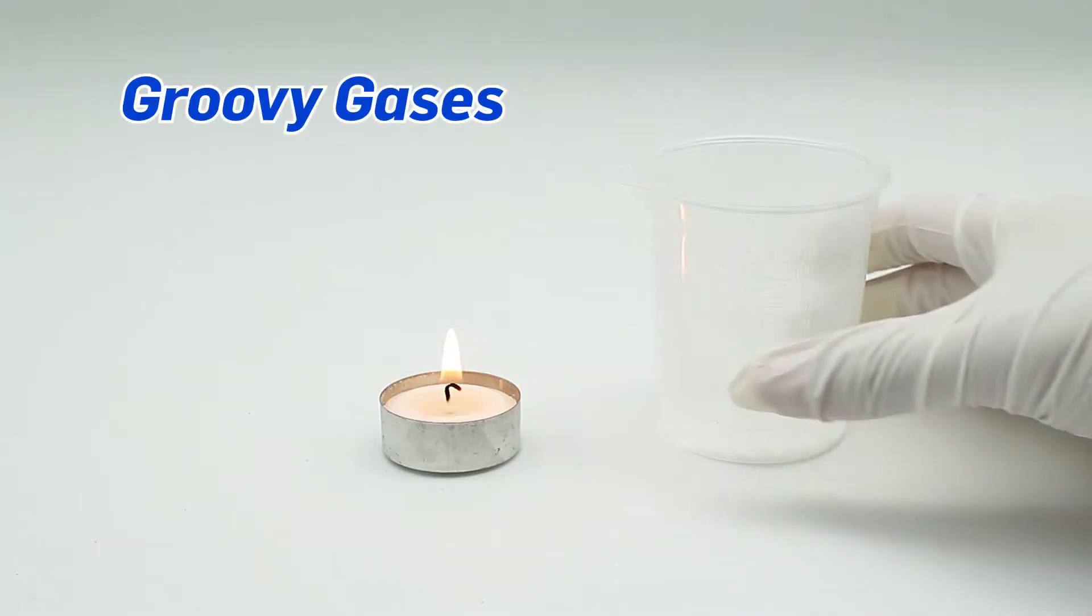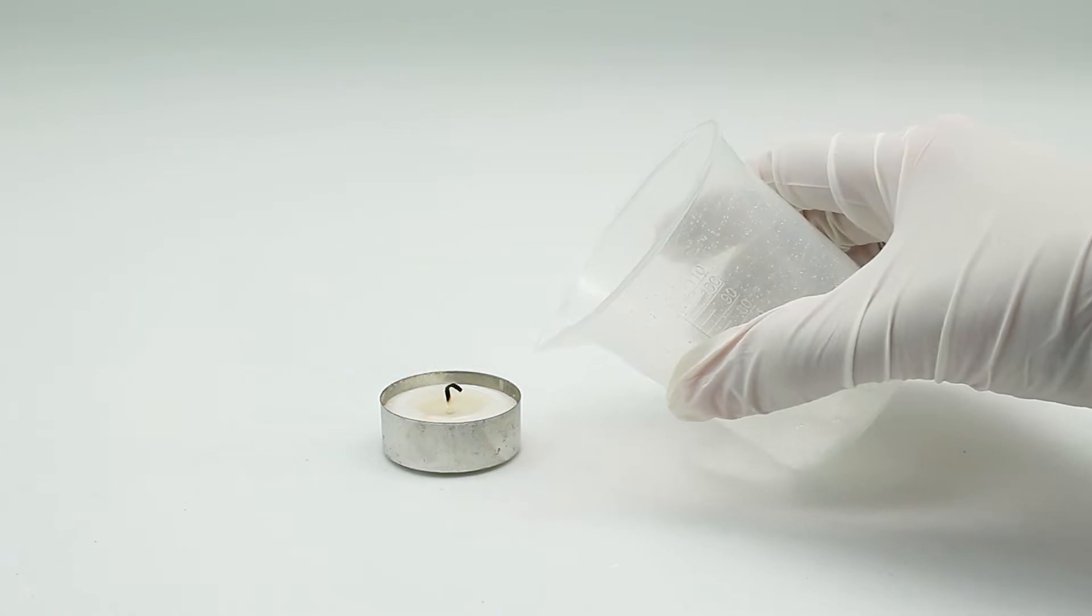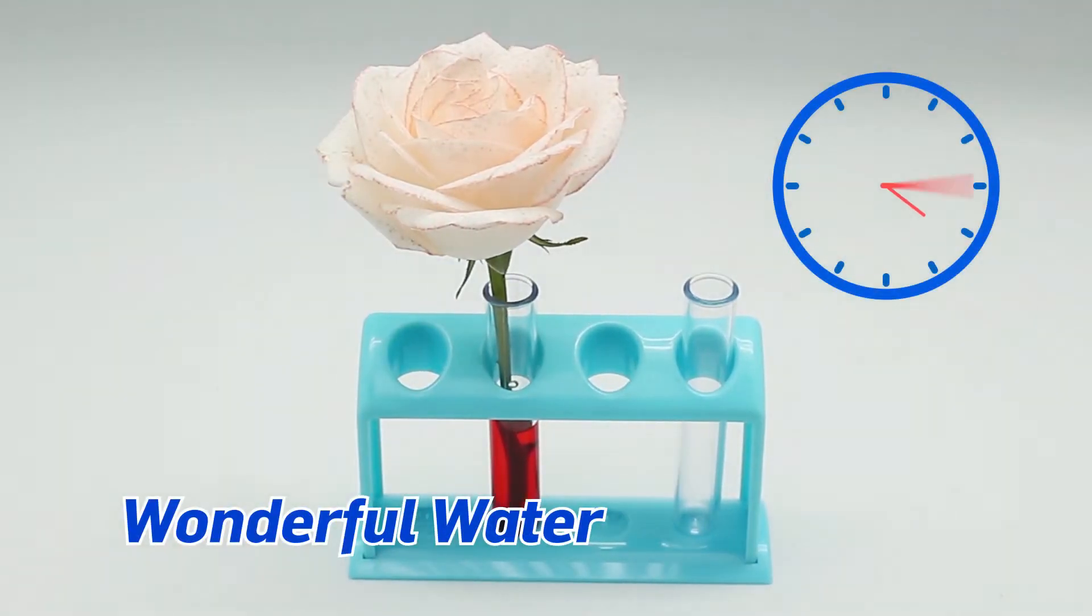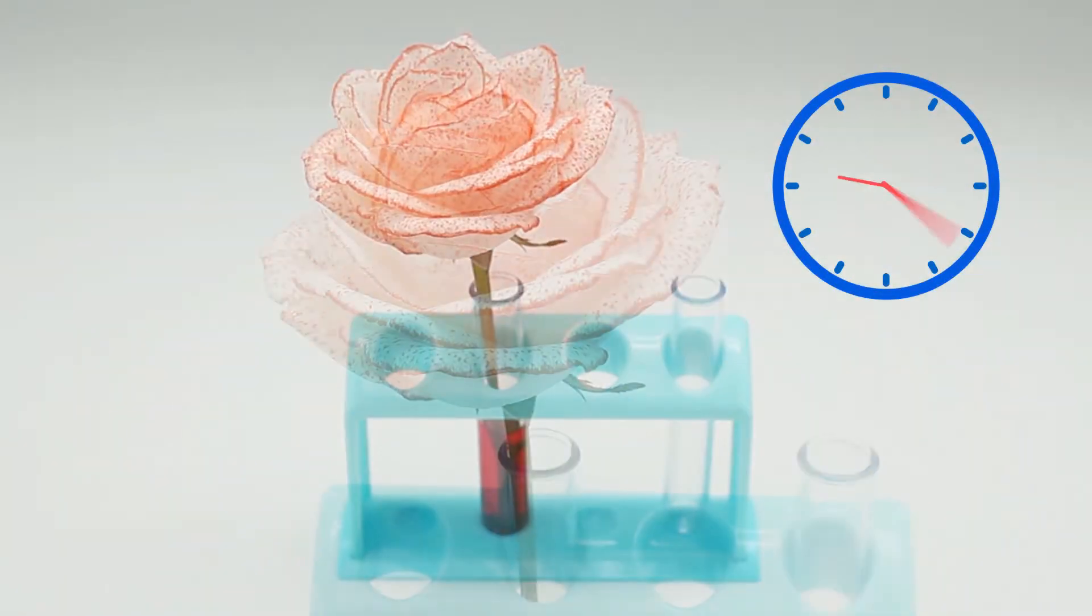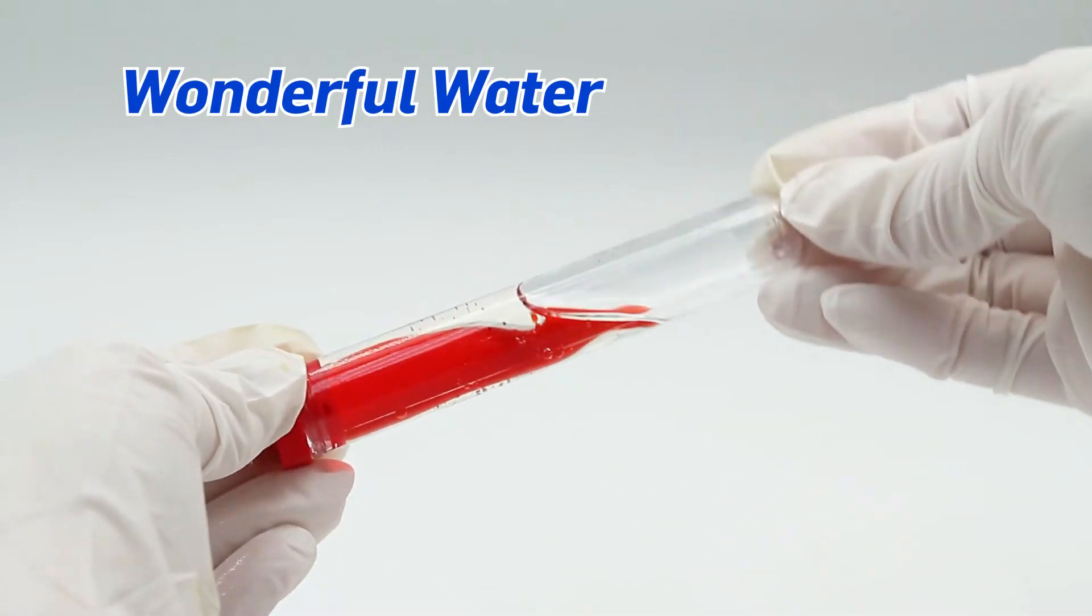And make a fire extinguisher with invisible carbon dioxide gas. Discover why wonderful water sticks to itself to climb up a flower stalk, but how it hates mixing with oil.